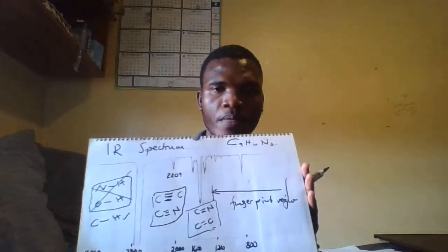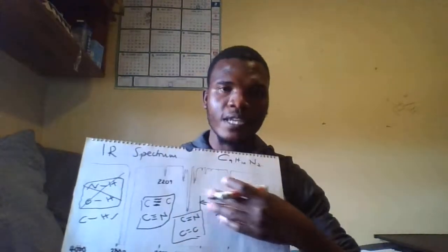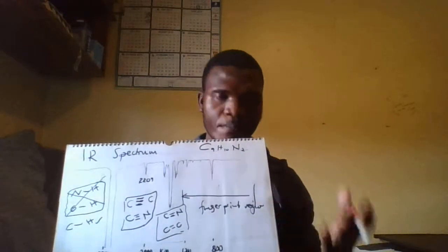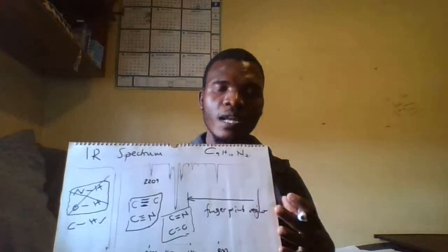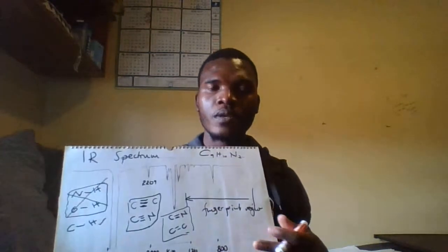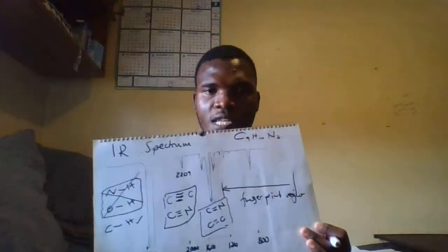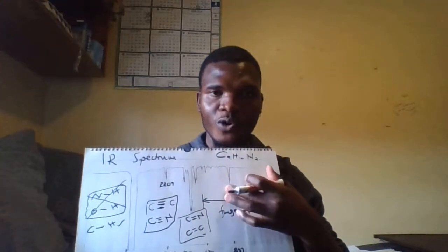So this is basically how we interpret this information about the infrared spectroscopy. So remember what I said here. It's a fingerprint region. Most molecules give similar stretches, you know, a similar spectrum. So for now, I'm not going to worry much about this, even though I know I have this peak that can be of concern.